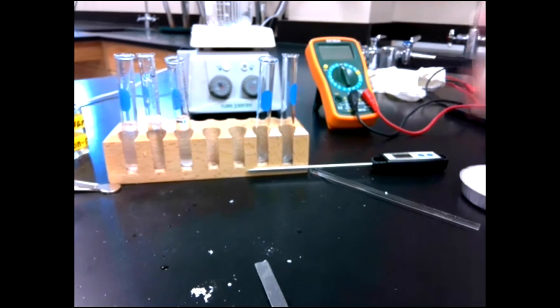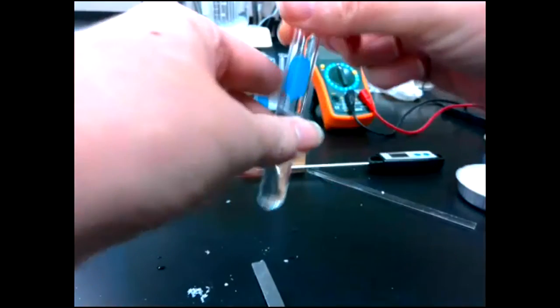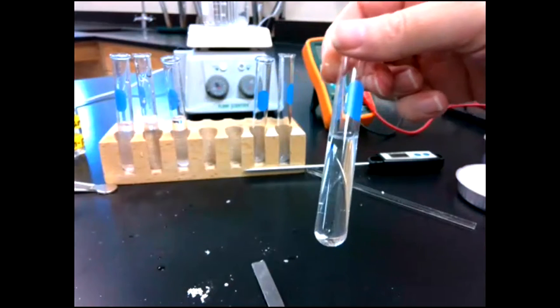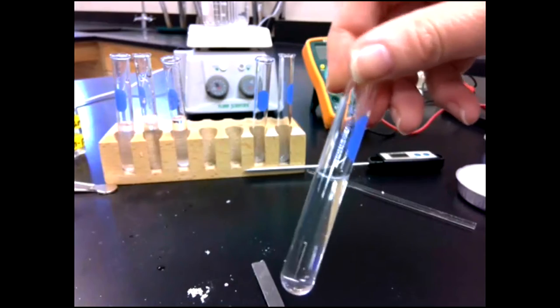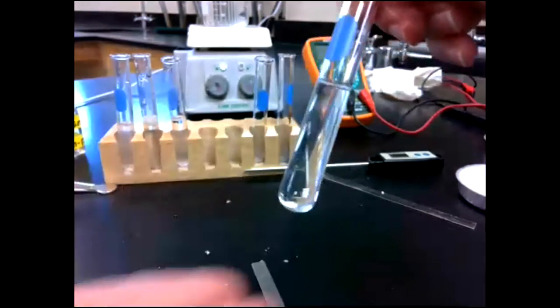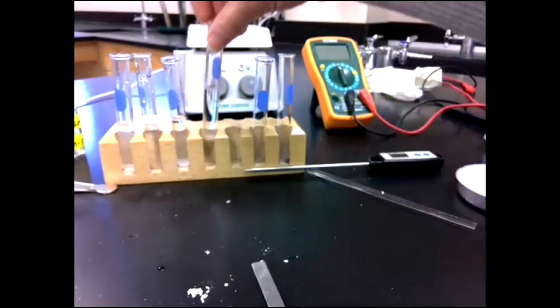We definitely do not want to light a match. I was thinking of doing the melting point with flames, and then I was like, but I can't have flames because I have hexanes and so flammable. Anyway, all right, it definitely is soluble. It's still on the way to dissolving, but again, we are going to label it yes or no, and this is a yes that it's soluble. They're getting smaller and smaller. Eventually, it will totally dissolve.